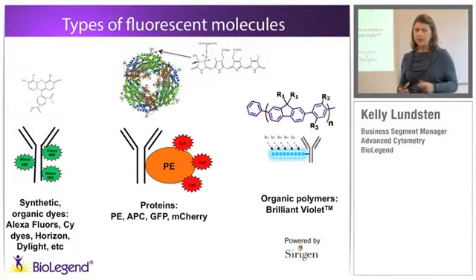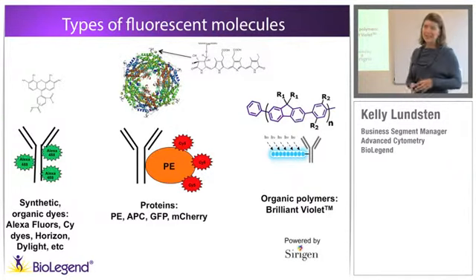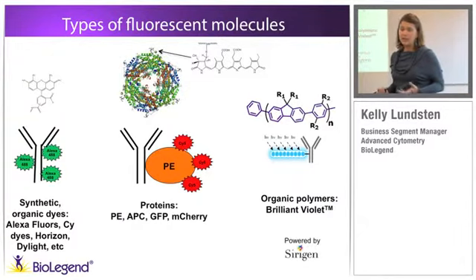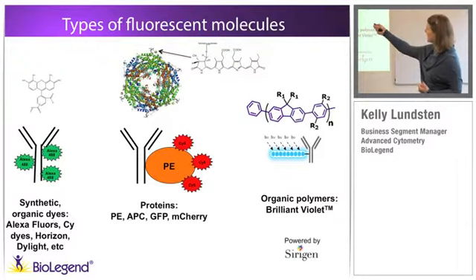Those bilins are the actual absorbing fluorophore of that macromolecule. But unfortunately, there's no way for us to isolate those bilins from the protein to remove them from that 240 kilodalton massive molecule. I mean, it's twice the size of your antibody. There's no way for us to remove those and for the bilins to remain fluorescent.